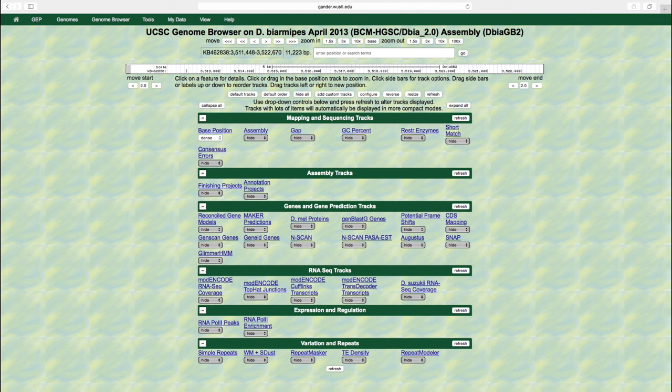Depending on the researcher's goals, it is often helpful to display only a subset of the available evidence tracks. You can control the display mode of each track through the drop-down lists at the bottom of the genome browser page. For example, the tracks that show sequence similarity to other organisms and the gene models from different gene predictors are available under the genes and gene prediction tracks category.